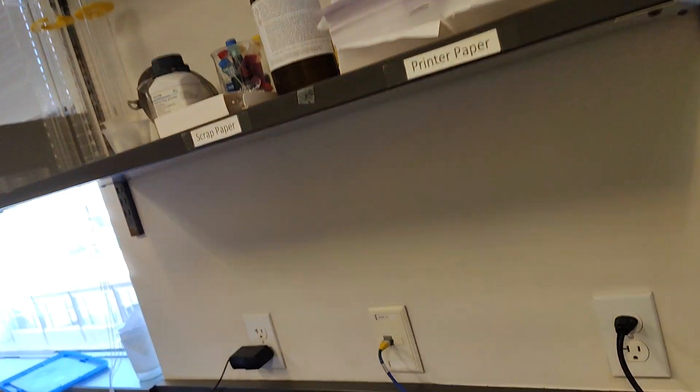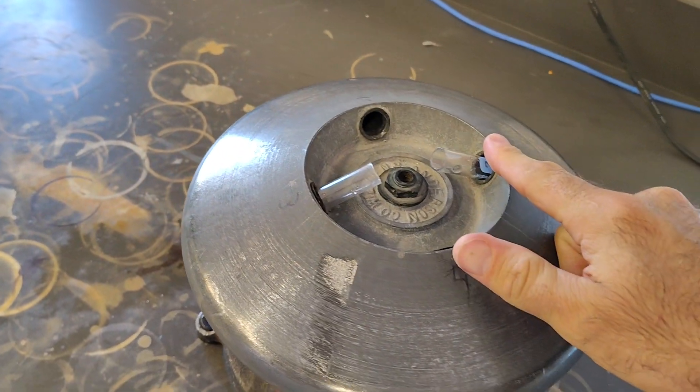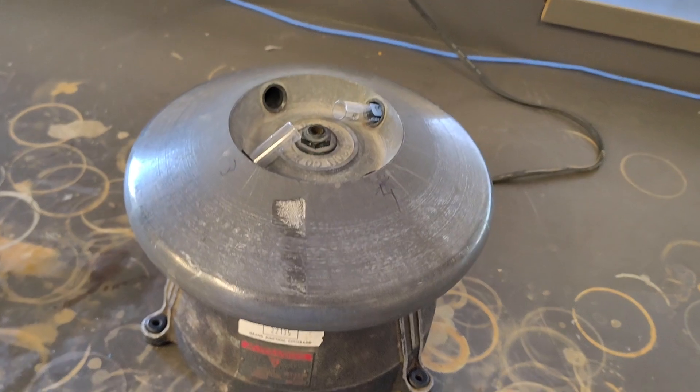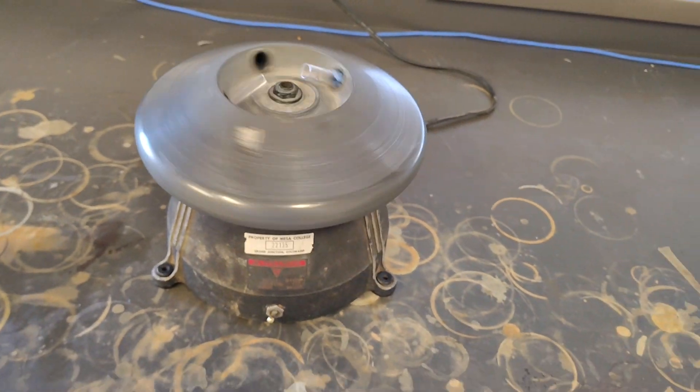So I'm going to start over here and put my liquid. It's very important when you do the centrifuge that you balance it. You have to have about equal liquid volumes here and there, otherwise it's going to go crazy. Then I'm going to turn it on, and while it's running for a minute, I'm going to explain how the centrifuge works.